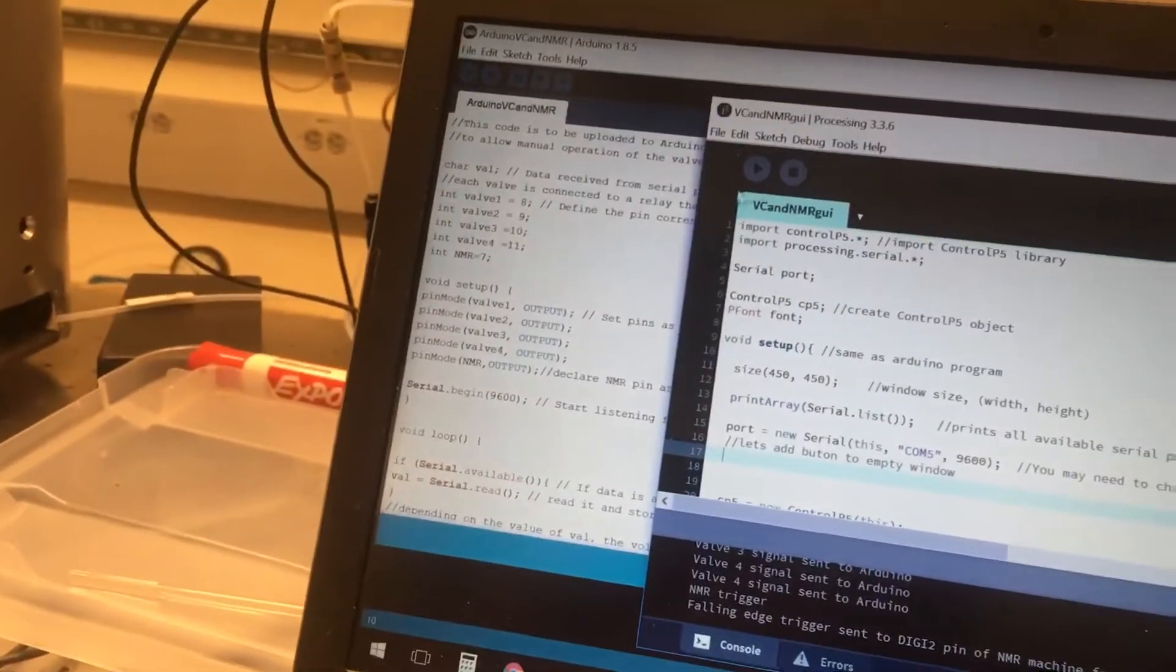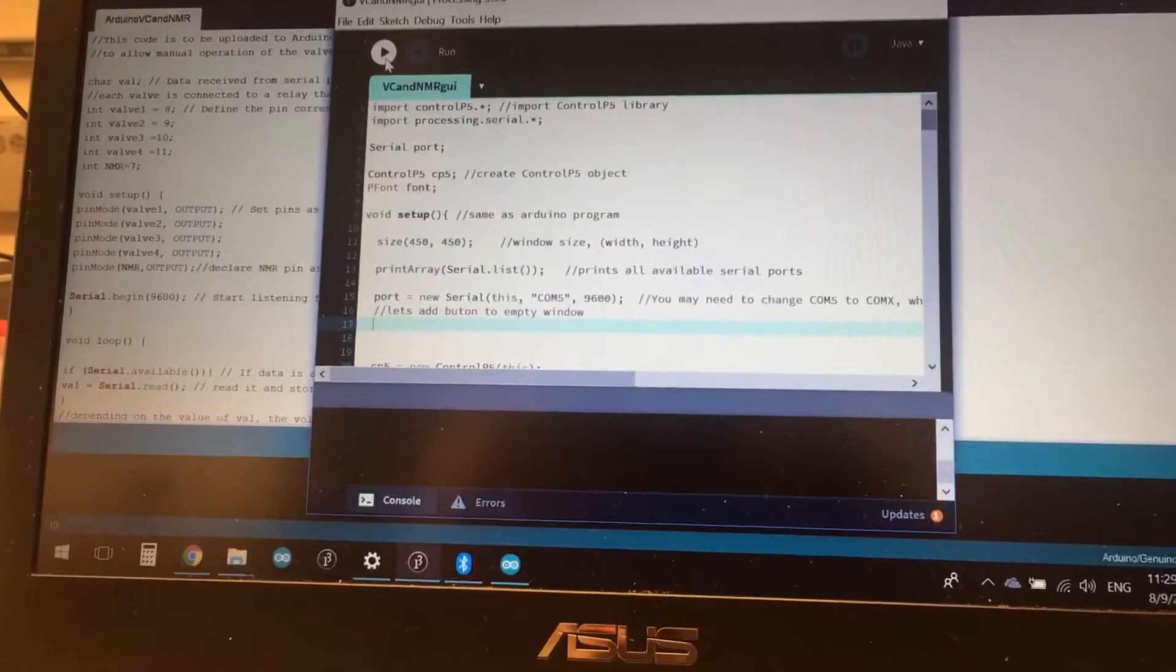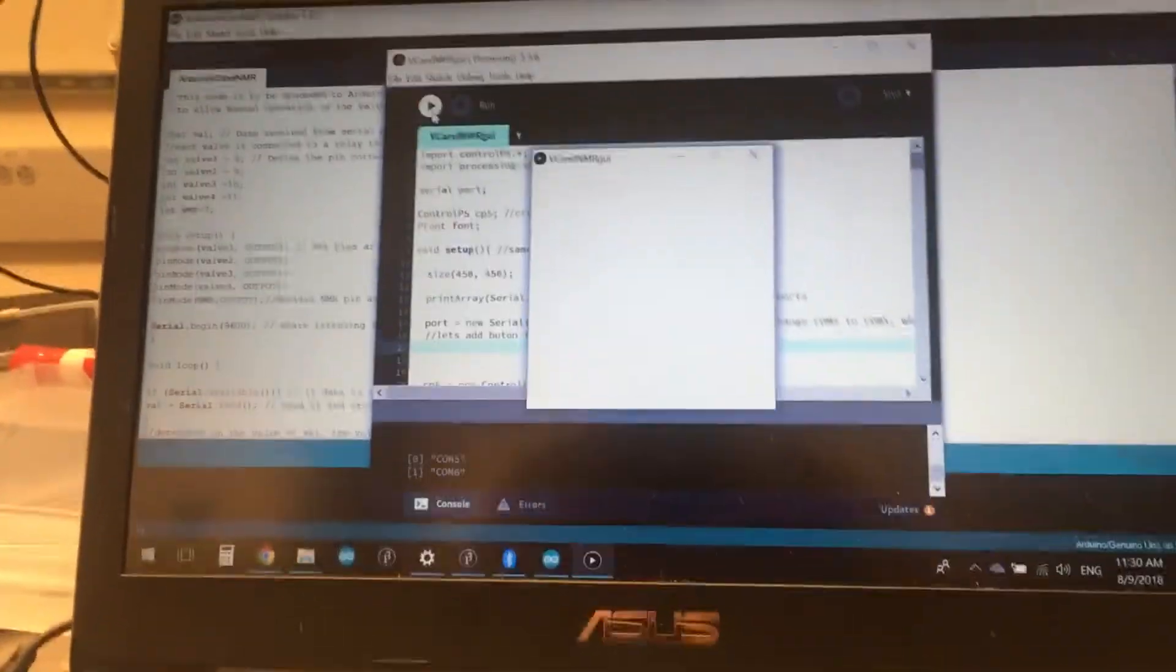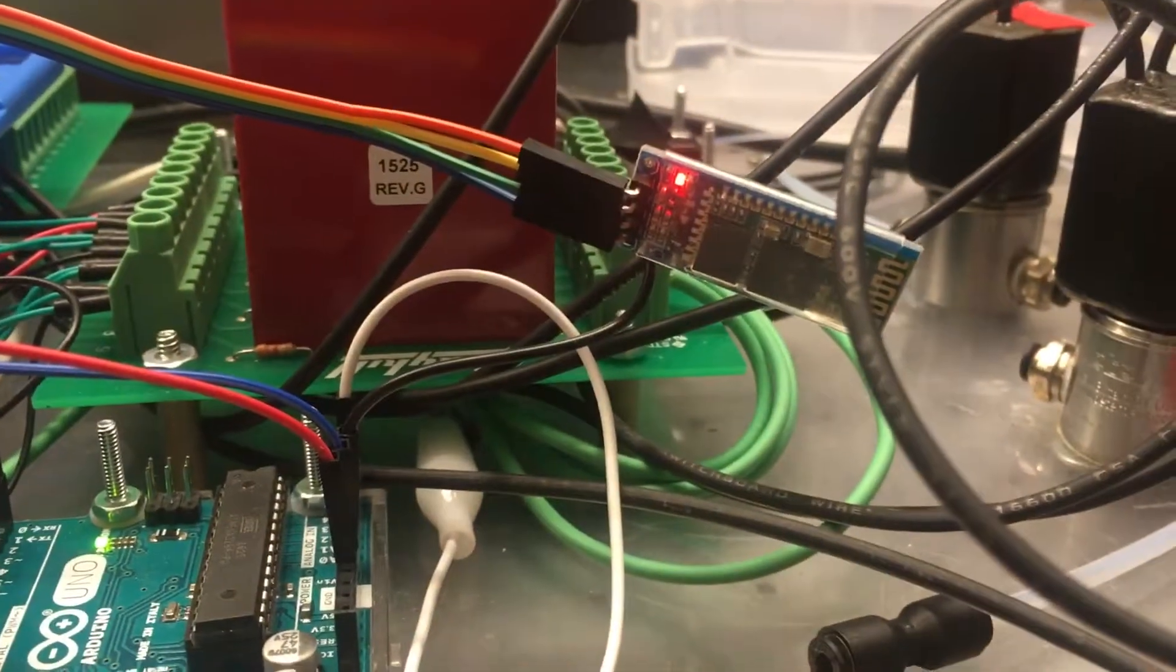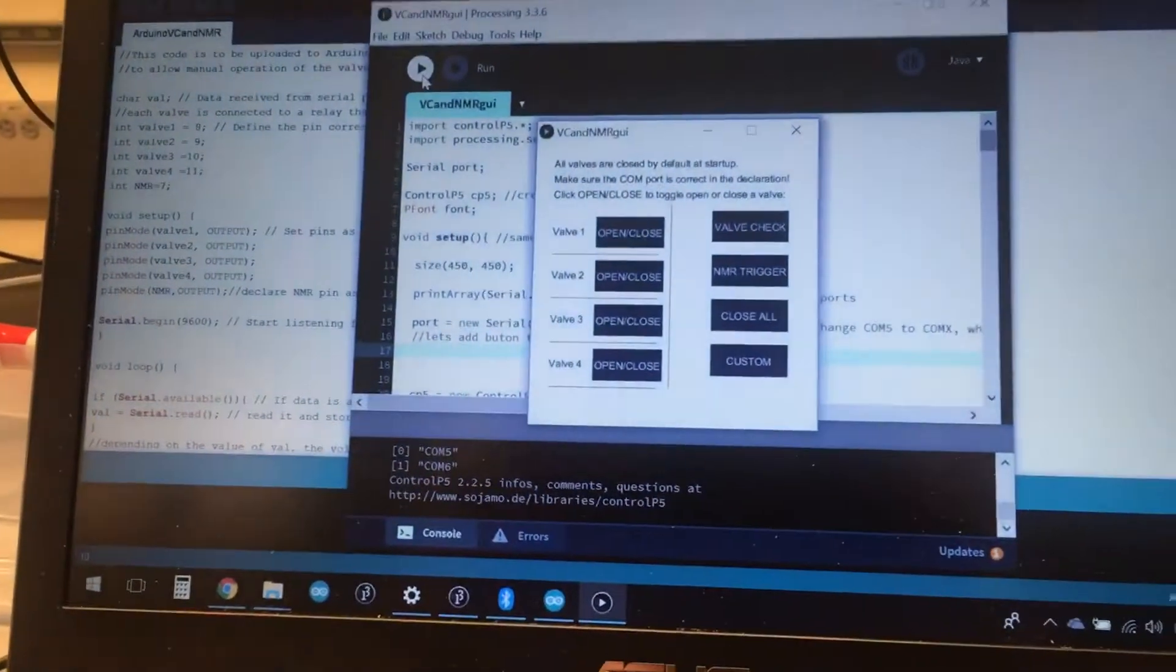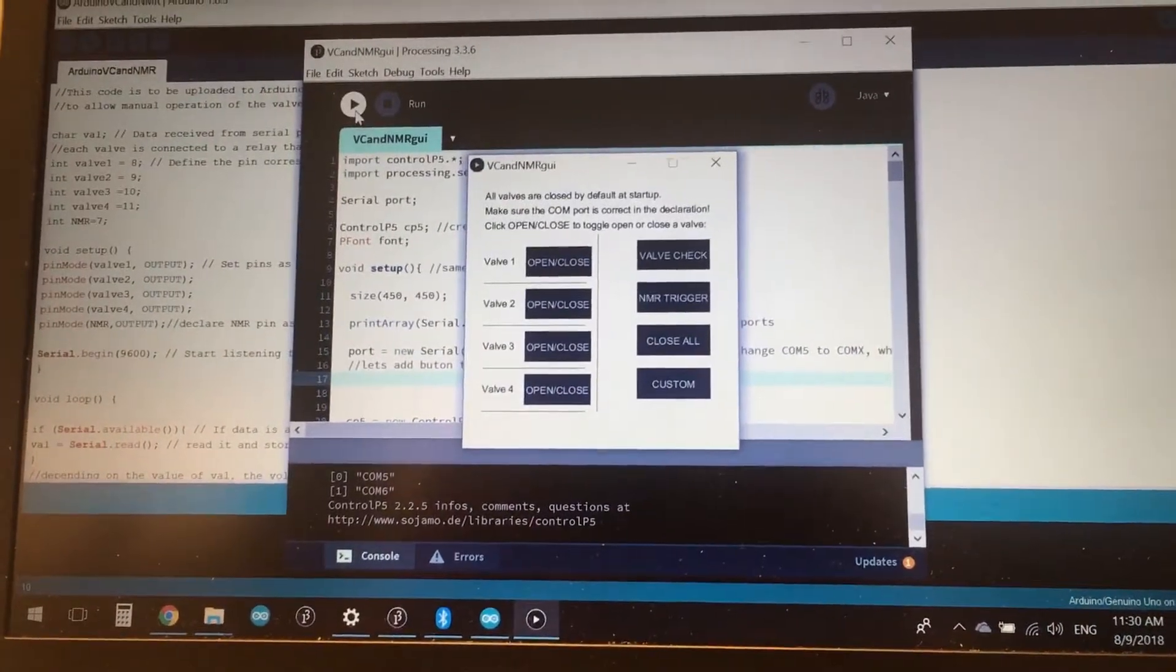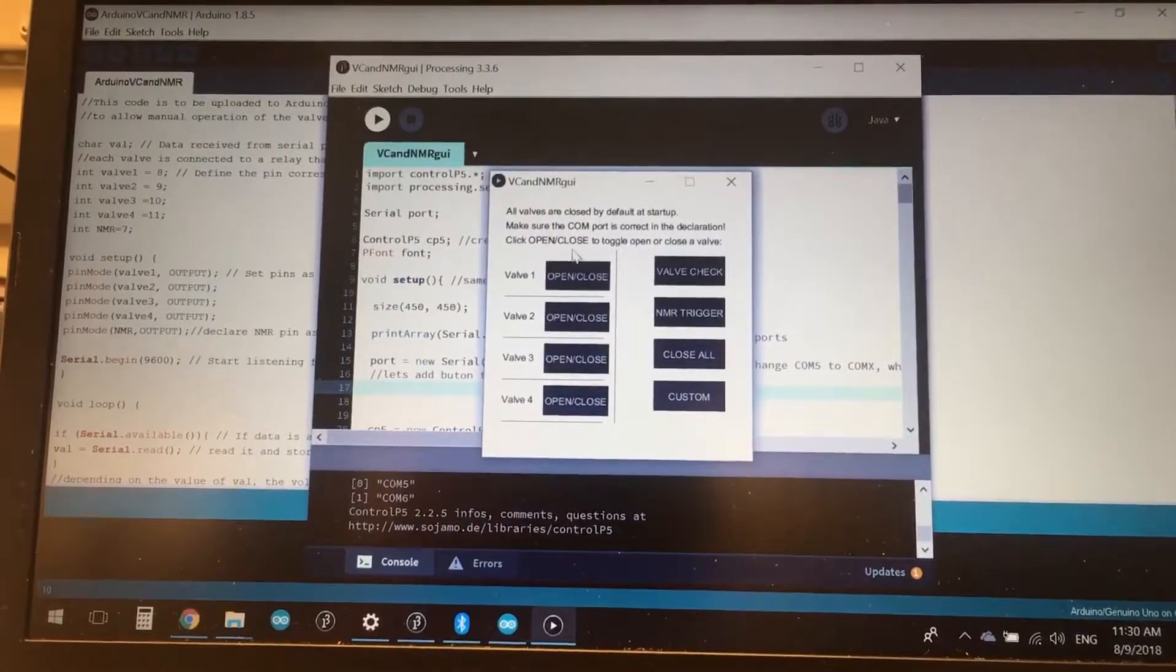If we run this code, what we would get after it loads is a graphical user interface. We'll also notice how this light is now solid, so it's now paired to the laptop wirelessly, and we get these toggle switches to operate the valves that we have in our process.